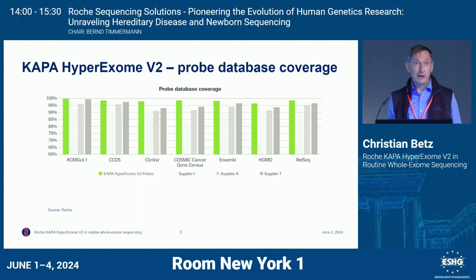Of course, you will find a lot of disclaimers on the slides that the product is for research use only. We have used this product in our lab as a lab-developed test, did all the validation here, so we were able to use it for diagnostic purposes.